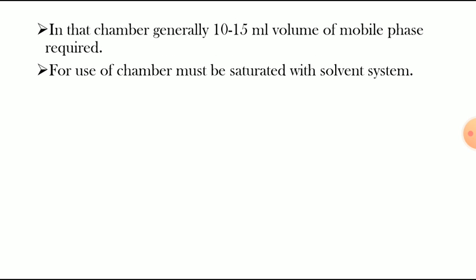Before use, the chamber must be saturated with the solvent system. That means when we pour the mobile phase into the twin tube chamber, we keep the lid on that chamber and it must saturate with the solvent system. Then we have to keep the plate in that chamber.